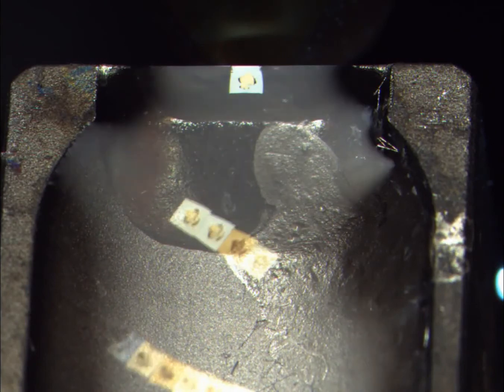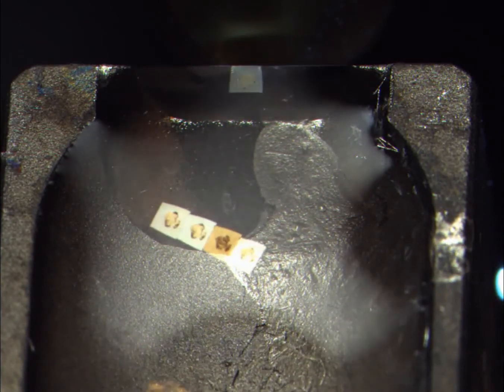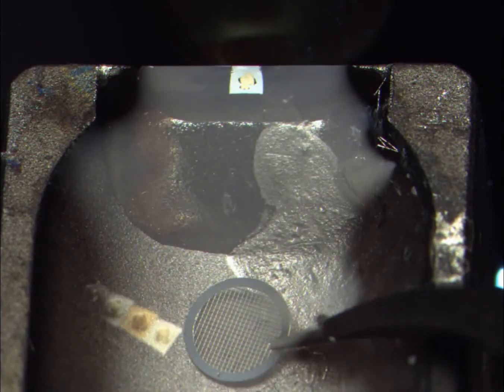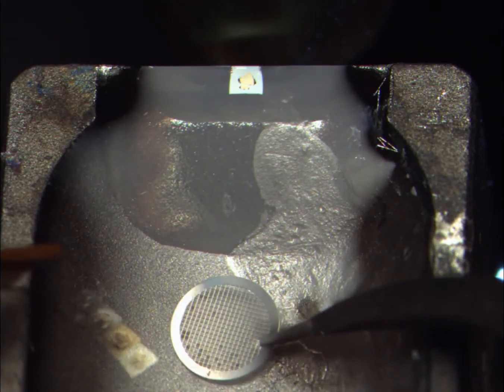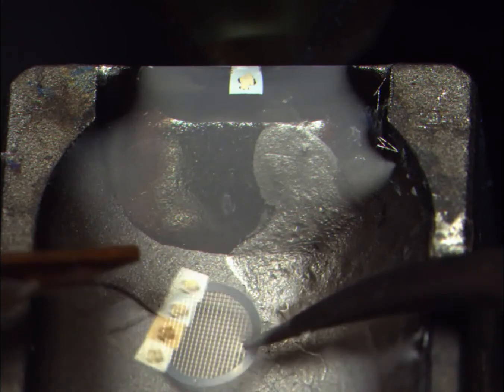Using an eyelash we can manipulate our sections and collect them onto a metal grid. We need to support our sections on this grid as the resin is so thin. The sample can then undergo one final stain before being taken to the transmission electron microscope.